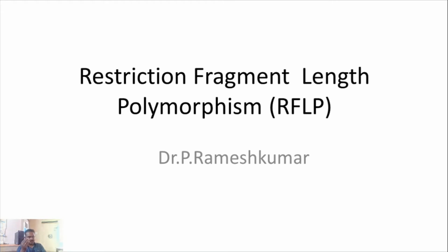There are 4 types of enzymes. The enzymes recognize and cleave the double stranded DNA. We know all of that information. So among the three techniques RFLP, RAPD and AFLP, the first technique is called restriction fragment length polymorphism.